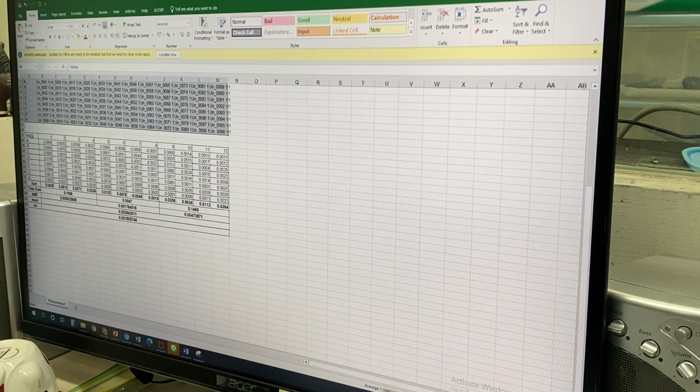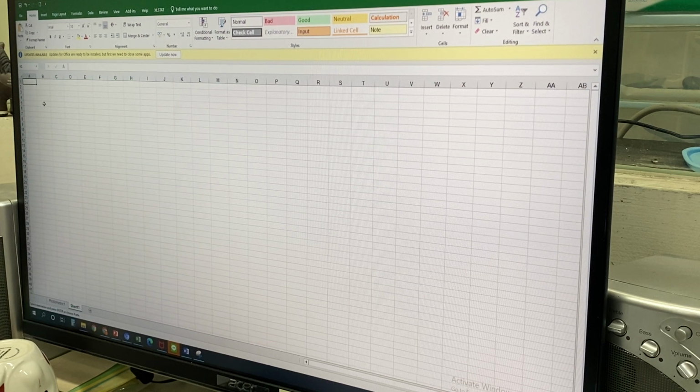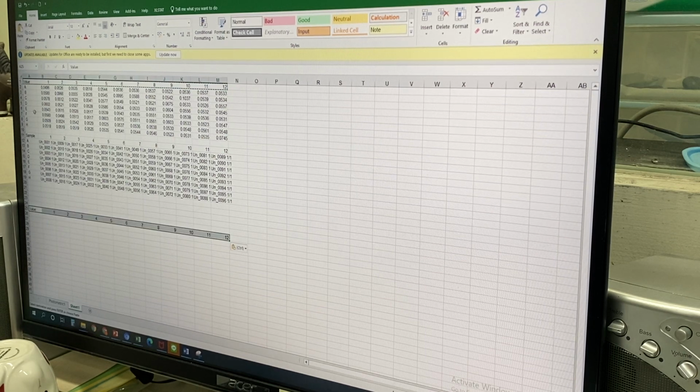Then you have to calculate that original series over here. So how can you do? You can do by yourself, such as I am copying from this one, okay, and I'll go to another set and just paste it over here, okay. So you can check that you just copy here, okay, and this one is a paste, okay.